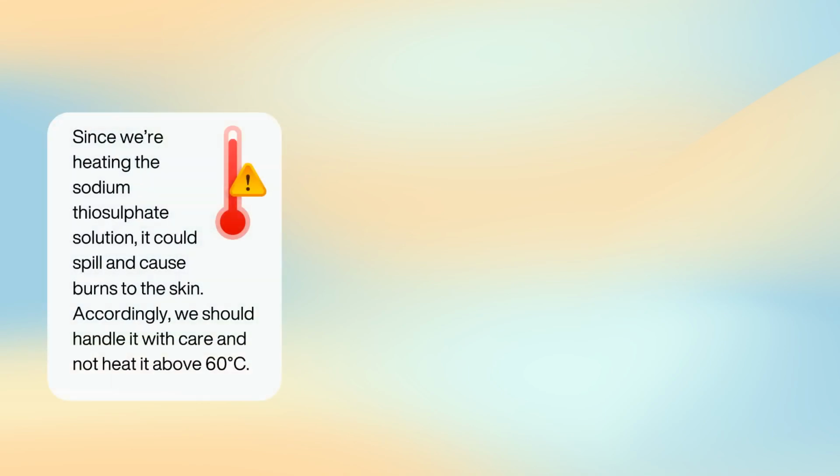Before we move on, there are a couple of things we need to consider with this experiment. Since we're heating the sodium thiosulfate solution, it could spill and cause burns to the skin. Accordingly, we should handle it with care and not heat it above 60 degrees Celsius.